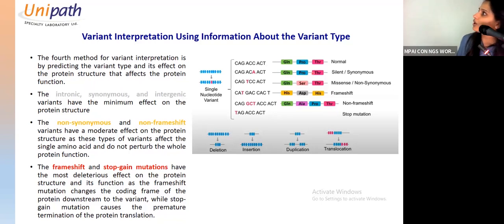That's why this is non-frameshift. And here the codon becomes a stop, and that's why the protein stops there. So based on that, these are criteria which can be applied.